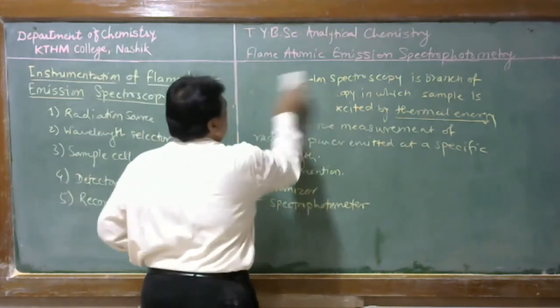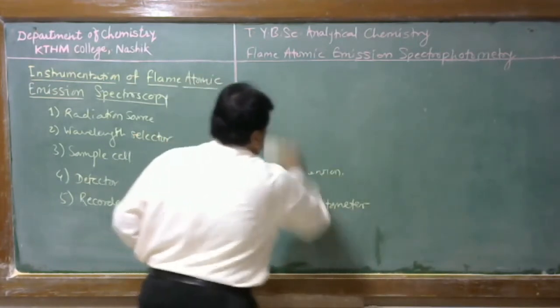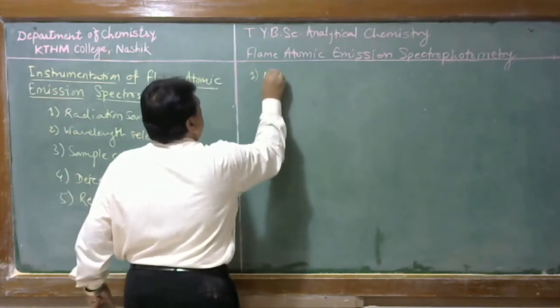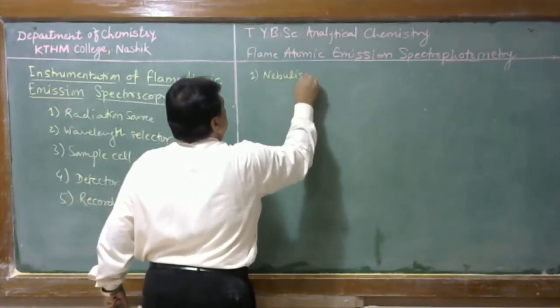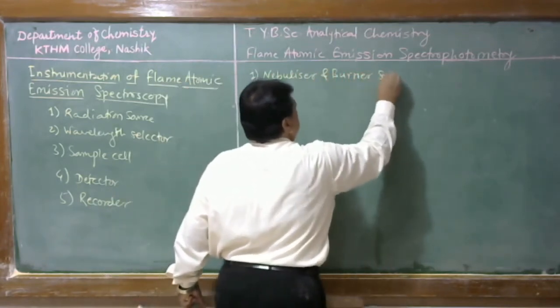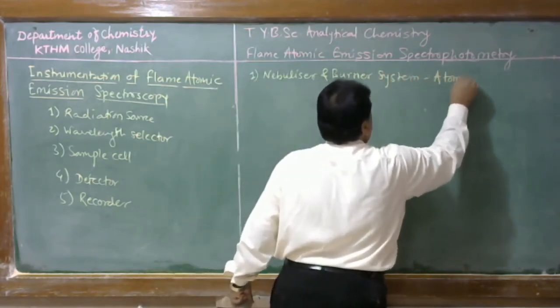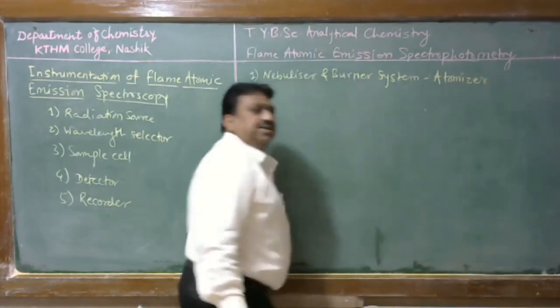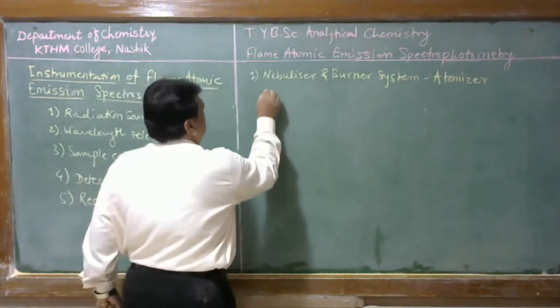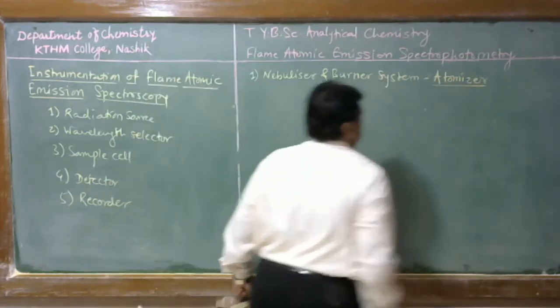The first component is the nebulizer and burner system, also called the atomizer. That device takes a sample solution and converts it into gaseous atoms, therefore it is called an atomizer.